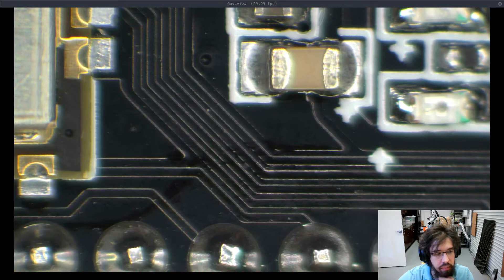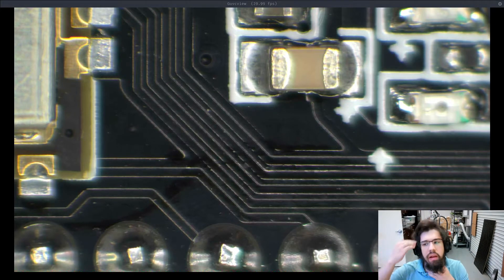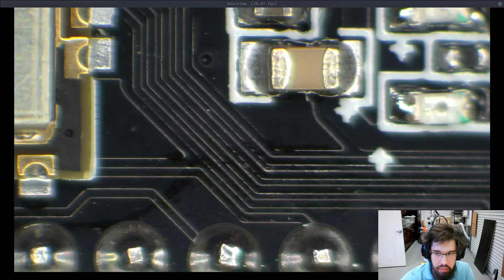This camera has the same megapixels as my old camera setup, which was an EOS Rebel T6 DSLR. I'm now using the Mosca 4K HDMI — it doesn't output 4K over USB, it outputs 1080p. I'm thinking about getting a USB 4K HDMI to USB converter, which do exist, where you could take 4K HDMI and output 4K to USB 3.0, 3.1, or 3.2 — I think it can support it at about 10 gigabit a second. I'll try that in the future, but for now I'll just do a quick review.